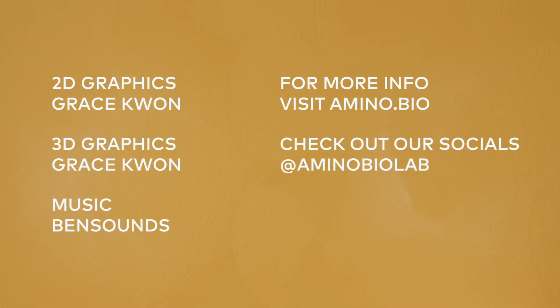Follow these safety guidelines for your safety and the success of your experiments. Learn more at Amino.bio.